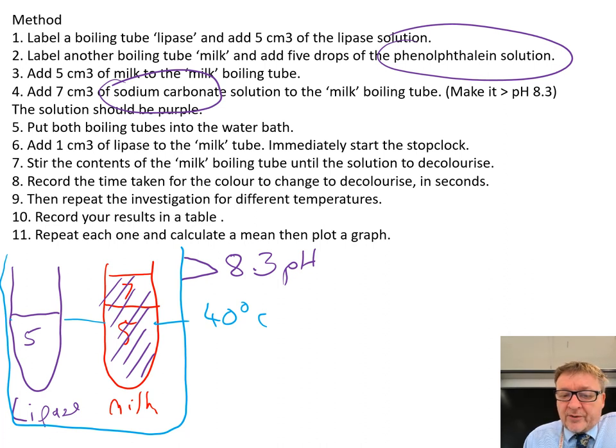Put the lipase into the milk tube and immediately start your stop clock. With a stirring thermometer in there, keep it stirring to make sure the liquids stay at exactly the right temperature and get mixed up.